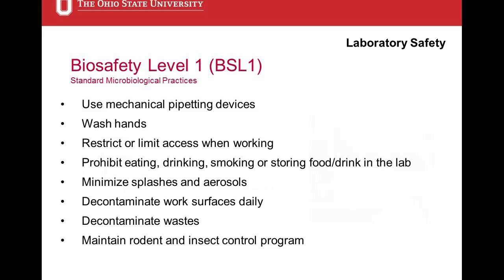This becomes an issue in some of the newer buildings where they've built the office space right into the lab bench areas. People want to sit at their desk at their computer and have their coffee or their breakfast or whatever it may be. Not allowed. You have to have it outside of the lab. It's unfortunate that that's the way they built stuff, but it's still a rule.